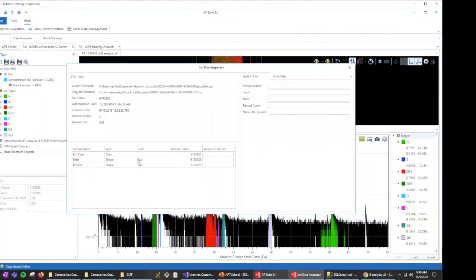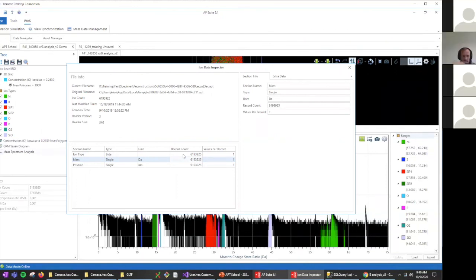I would have a question, Peter and Marcus and Andrew and anyone else. What do you want to see from us in terms of this type of interoperability? You're developing your tools now, and we're a little behind, I'd say, in where we'd like to be, but we're moving in that direction. What can we do to help speed up adoption or make it worth the effort of making things work with APSuite rather than just continuing entirely separately?